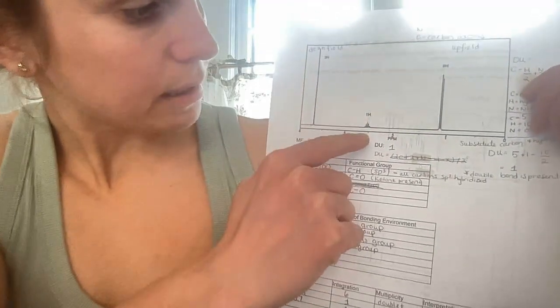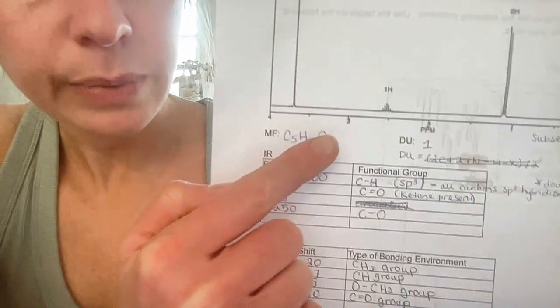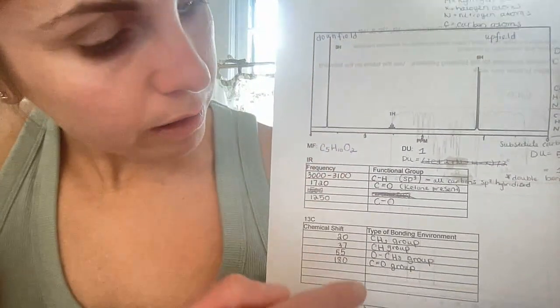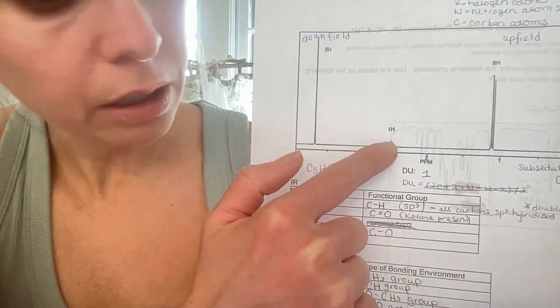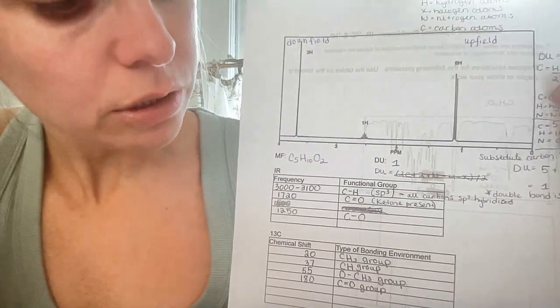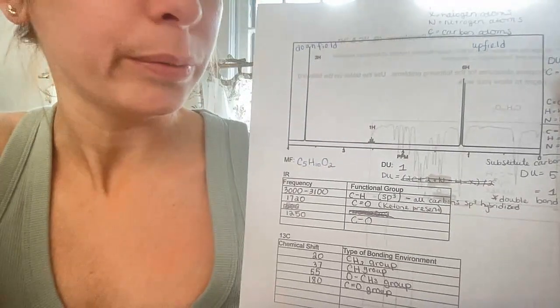Next, we have a chemical shift of 2.7, which is a pentet right around here. You can tell that this is a pentet given the number of lines. We know that the integration is 1, given this 1H right up here. The interpretation is that the protons are close to the electronegative group.